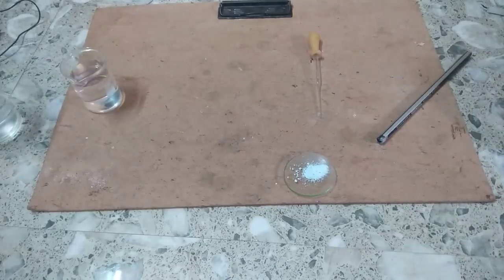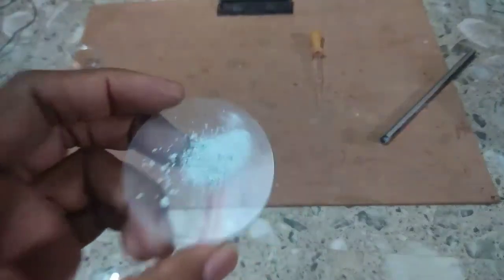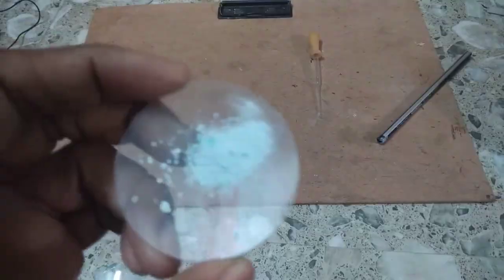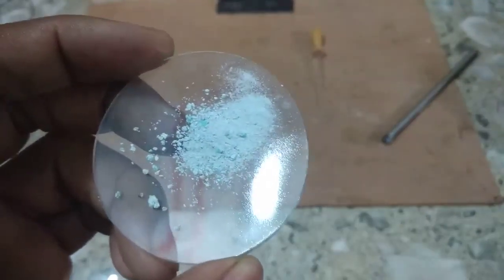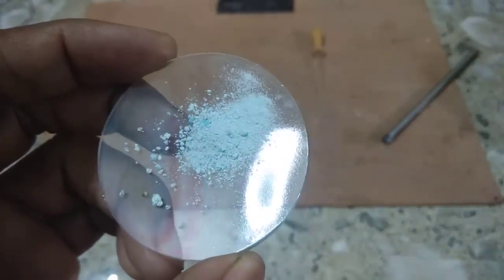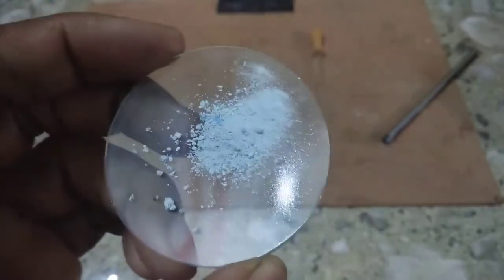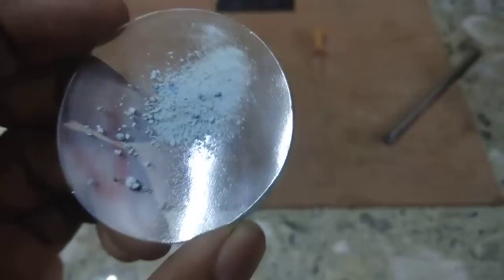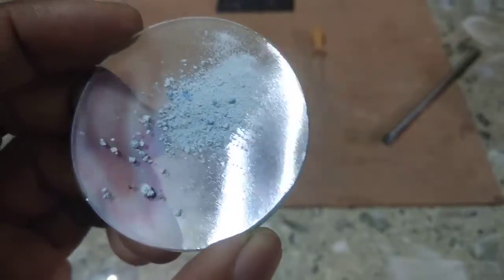Now you see, we have taken the heated copper sulfate and you see this is white in color. That means the blue copper sulfate changes into white color. That means it loses its water of crystallization, that is 5H2O. Now you see, this is copper sulfate but white in color, that means it loses its water of crystallization.